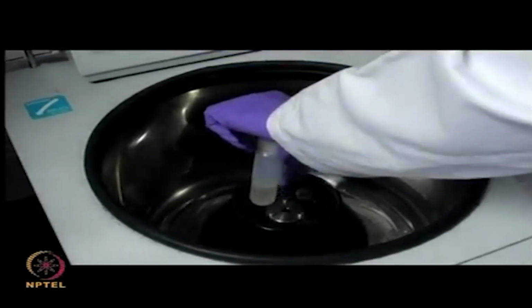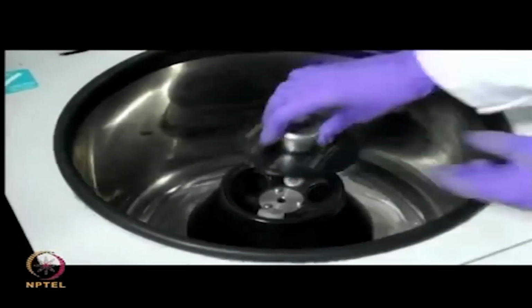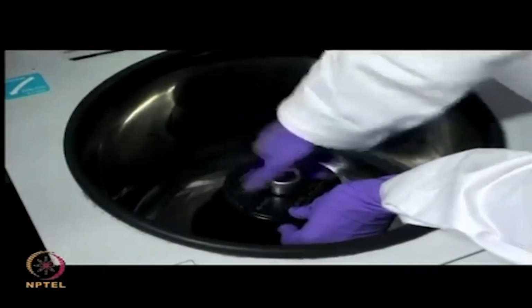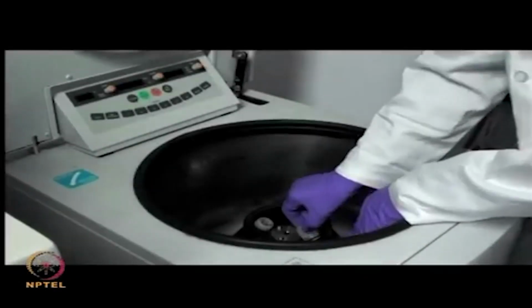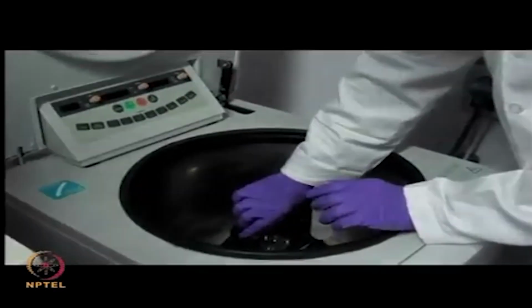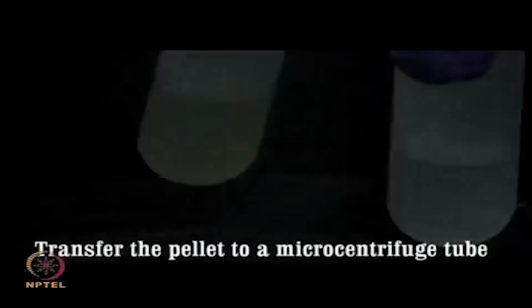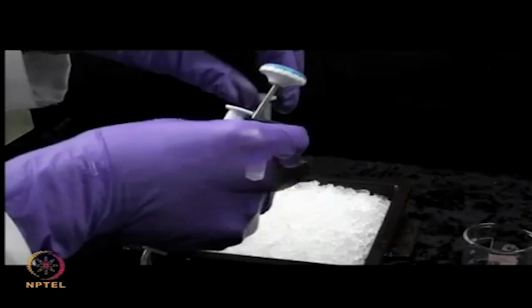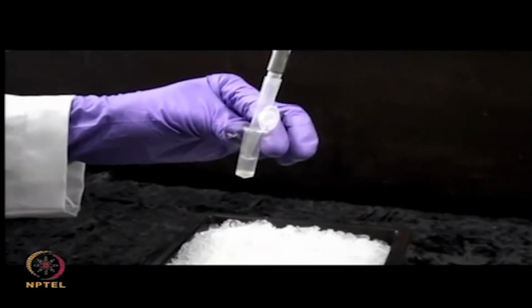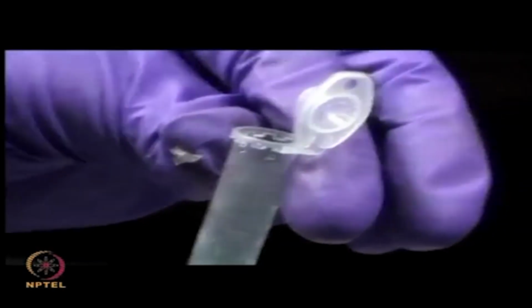Centrifuge this tube at 12,000 rpm for 10 minutes, maintaining a temperature of 4 degrees Celsius. Transfer the pellet obtained, containing intact bacterial cells, to a fresh microcentrifuge tube. Wash this pellet thoroughly with phosphate buffer to remove any unwanted debris.